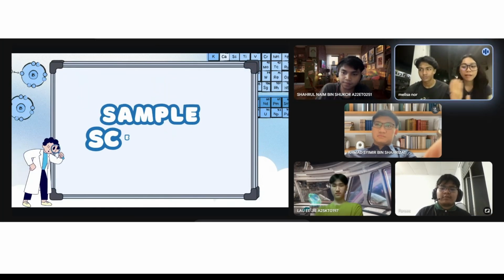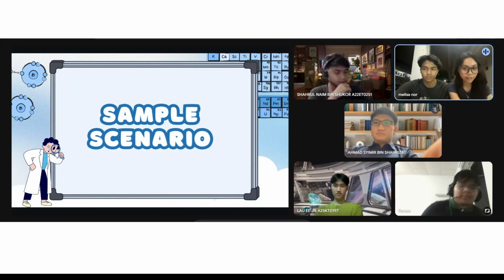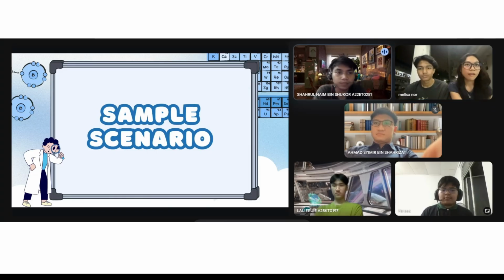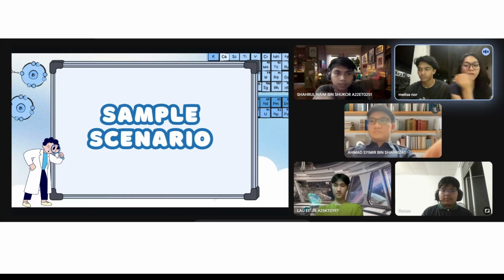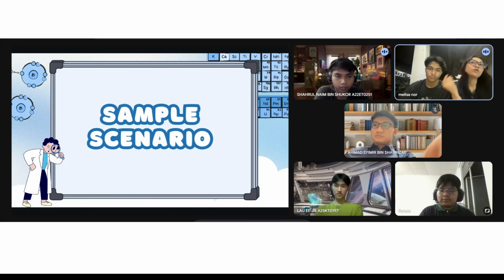Let's consider a bioethanol refinery in Malaysia that uses EFB as a feedstock. After pre-treatment and hydrolysis, cellulose from EFB is converted into glucose. Microorganisms such as yeast will then ferment the glucose into ethanol. So throughout the fermentation process, the technicians need to monitor the glucose concentration.